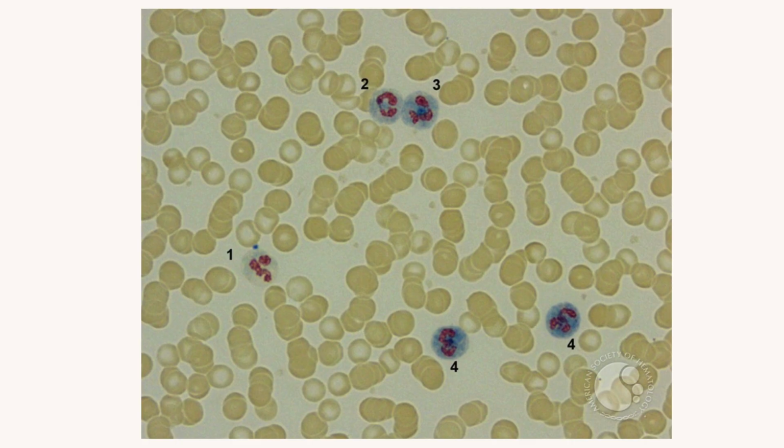Afterwards, wash the smear again in distilled water for 2 minutes. And once again, do not allow smears to dry. Afterwards, counterstain with Mayer's hematoxylin for 10 minutes. Rinse again using distilled water for 3 minutes.